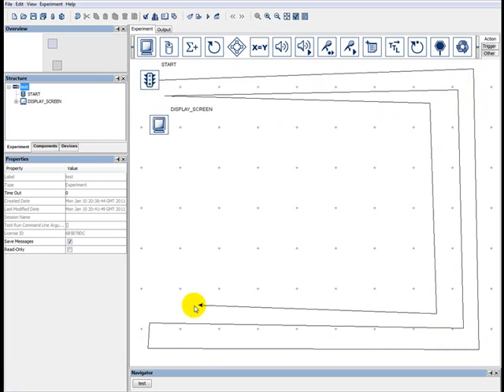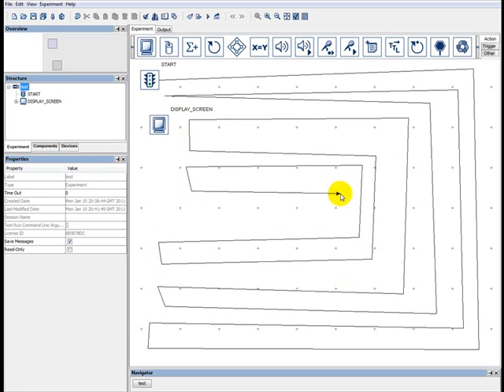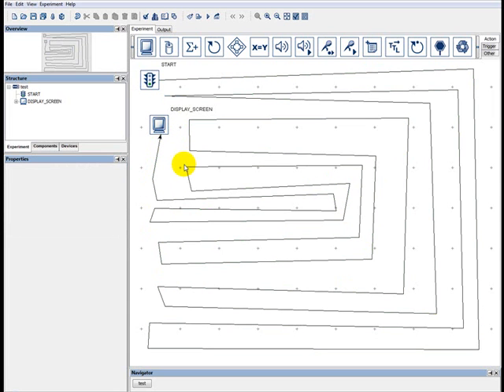This is all a bit silly, obviously, but the point is that it's good to get a nice old bit of experience with the software that you're going to be staring at for many hours before you dive into it completely. Okay, so on this fantastic bit of artwork, we will end the first one there. And if you connect the two up in this very silly fashion and test run it, you will find, I can guarantee you, that it'll work perfectly just as it did before.